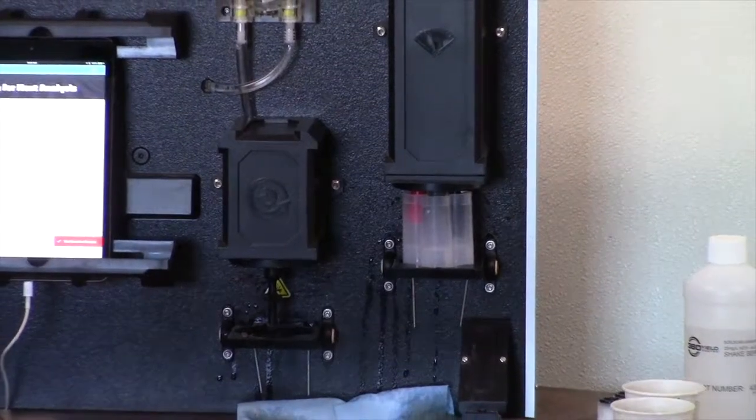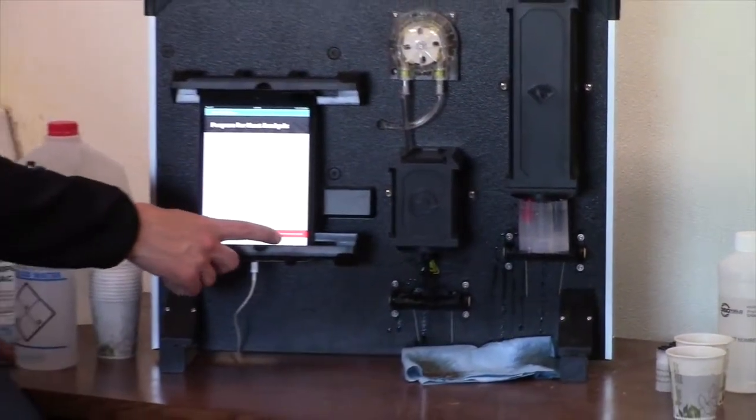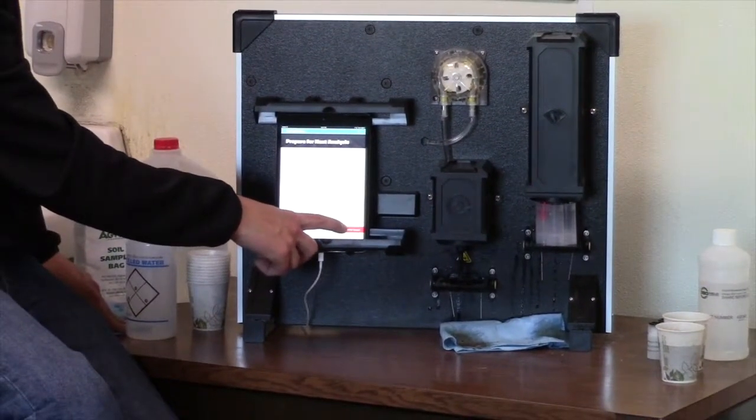So we go back to our 360 Soil Scan app, and we click the bottom right button that says Test Another Soil Sample.